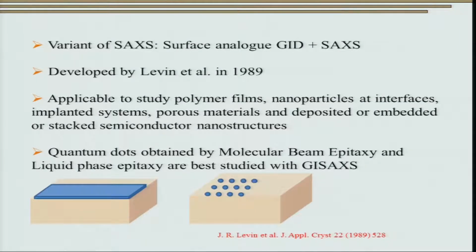The most important part and the biggest advantage that GISAXS offers is that we can really monitor the evolution of size, shape and morphology, as well as the distribution on the plane, a 2D distribution, while the deposition is occurring. So, this way it offers us a tool to constantly monitor the evolution of these nanoscopic structures and the ability to play with the processing parameters, or rather the deposition parameters, to control the size, shape and morphology of the nanoscopic entities to be processed.